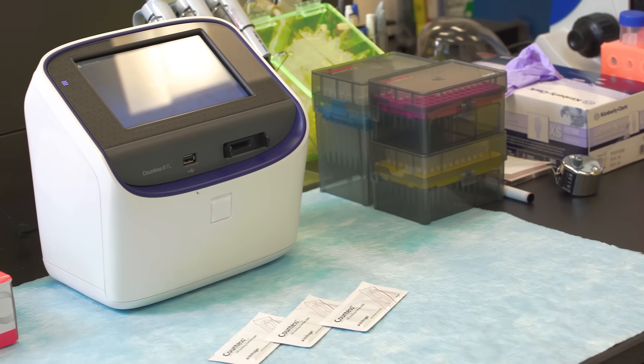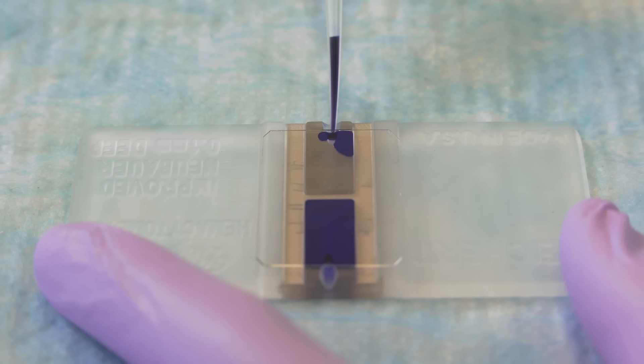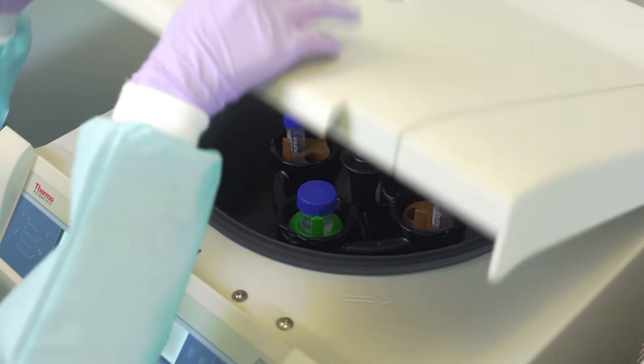A cell counting machine, such as the Countess, gives you quick, accurate counts needed during culturing. Or you can count cells manually with a hemocytometer. You may also wish to have the centrifuge located in the cell culture facility.